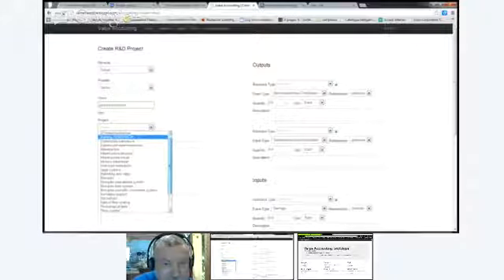So you're creating an R&D project, right? Yeah. Okay. So maybe gluing transducers while playing with the. Okay. So this is a way to create an R&D project which helps you to document your work and to log your output. Yes. Yes.